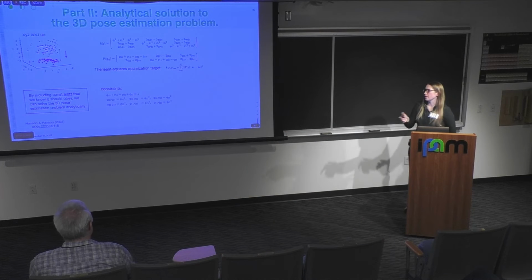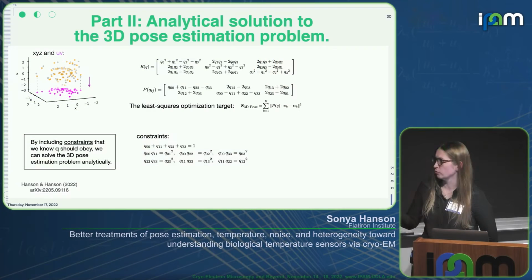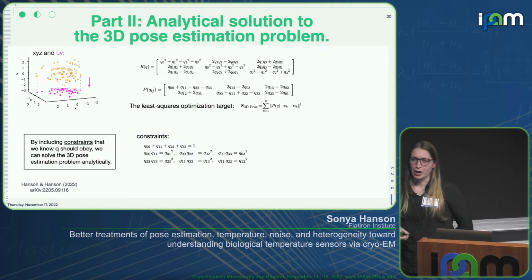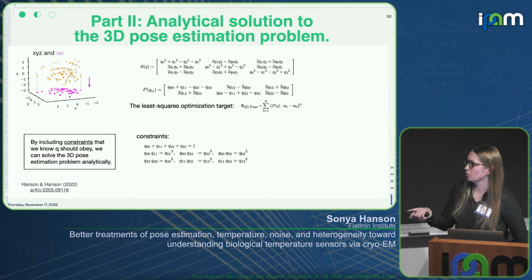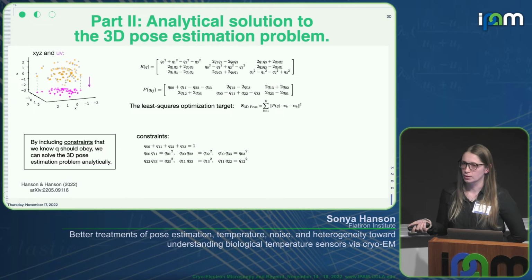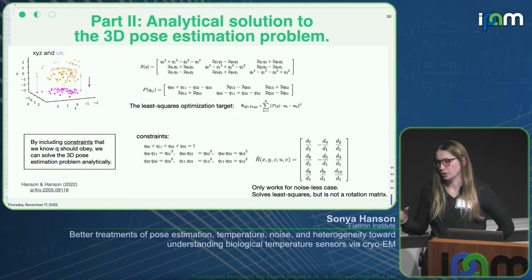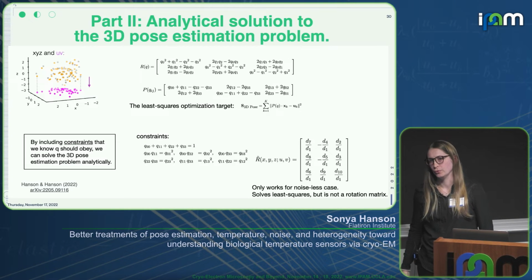Is it wicked fast, or is it? Well, so the thing is that if you don't use the right set of constraints, it will give you an answer that's like 40 megabytes long. Which is not very nice. But if you play around with the constraints and how you actually set up this minimization, then you can get it to give you this simple solution here. But it takes an hour or two to run.